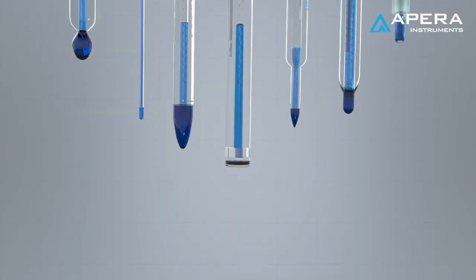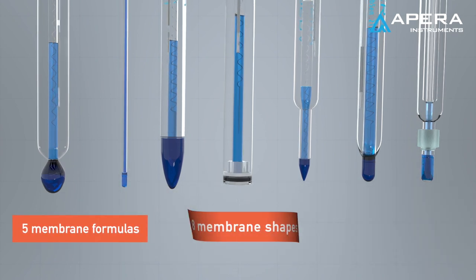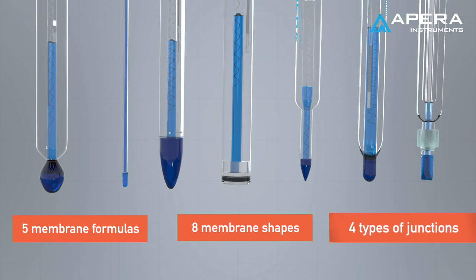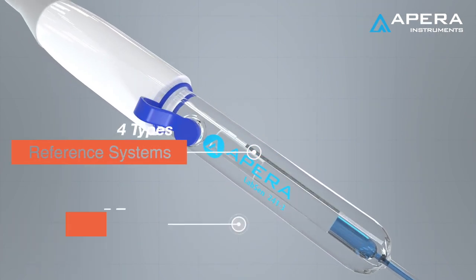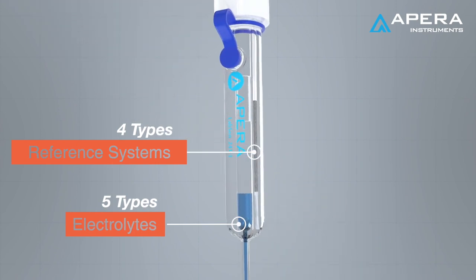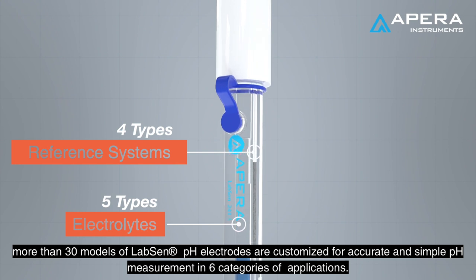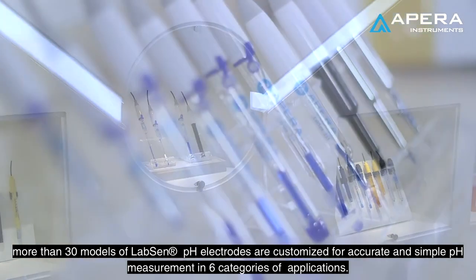With five formulas of sensitive glass membranes, eight membrane shapes, four types of junctions, four types of reference systems, and five types of electrolytes, more than 30 models of labs and pH electrodes are customized for accurate and simple pH measurement in six categories of applications.